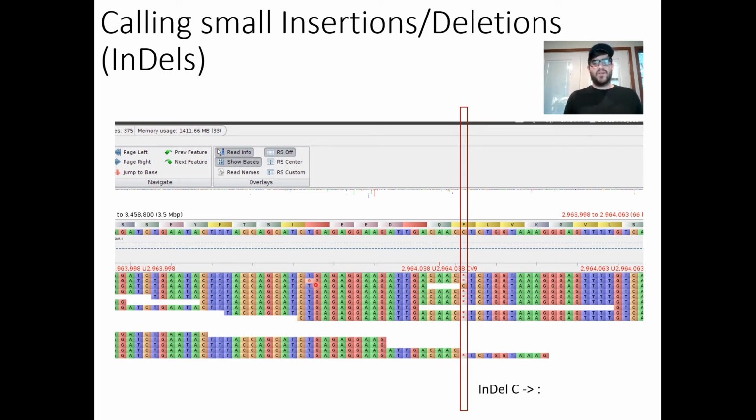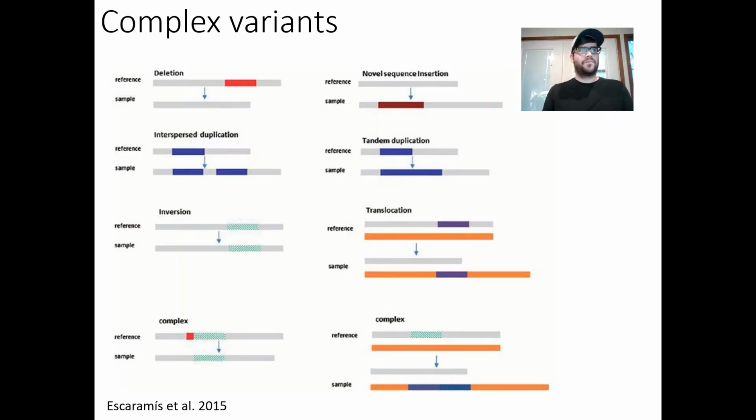And this is something that we also have to deal with a lot with this data. In general, the Illumina data is like 99%, 99.5% accurate, but every once in a while you get an error like this. And so when we're doing filtering, we need to have strict criteria so that this single G here wouldn't be called a polymorphism. So that's really important when we're doing our downstream analyses. And so those are small-scale variants, so either a single nucleotide that switches from one base pair to another, or a little bit larger variants of maybe 10 or 20 base pairs.